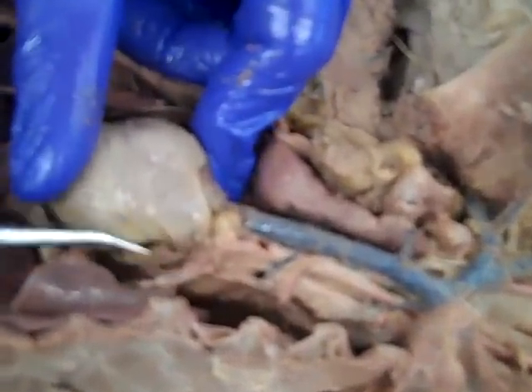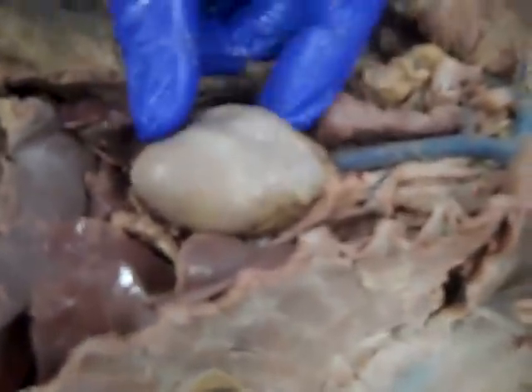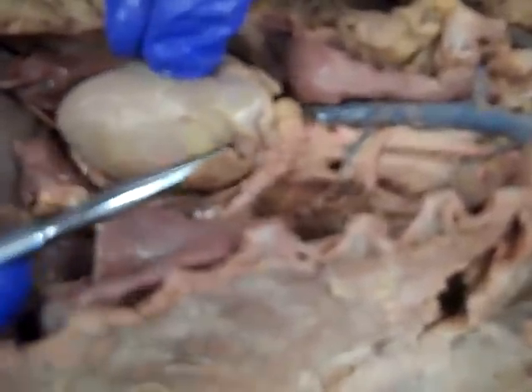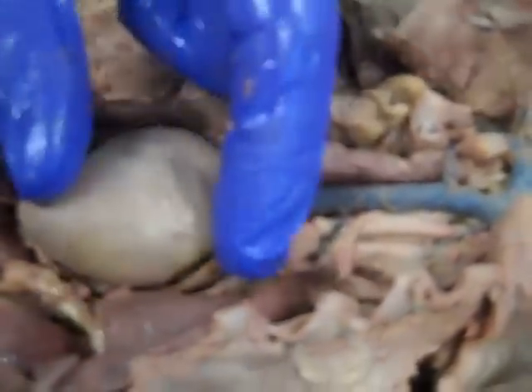And when we look at our heart, we can see our two auricles. Okay, we got our two auricles right there. Let me turn this a little bit like that. And right in between the two auricles, we got our pulmonary trunk. Kind of empty looking right now, which makes sense because the cat's dead. So there's the pulmonary trunk. So easy just to stab a pin right in there for a lab practical.